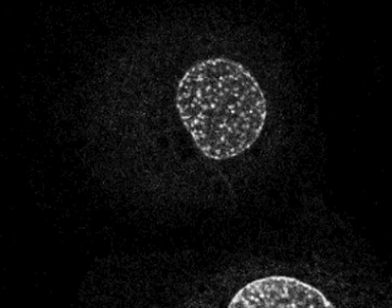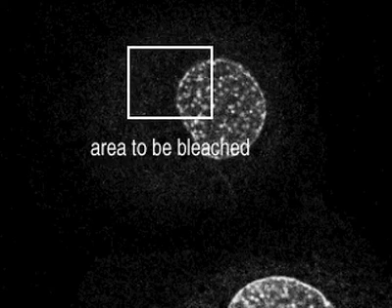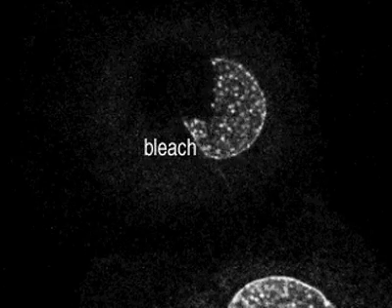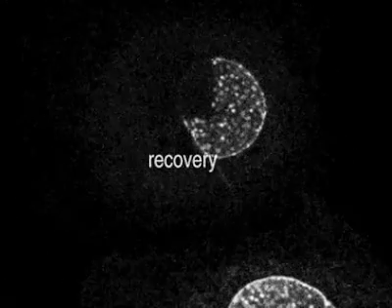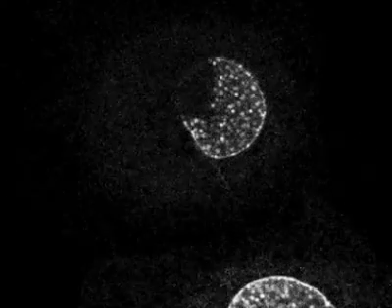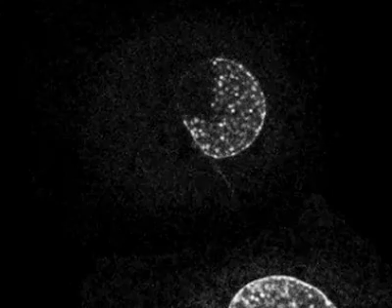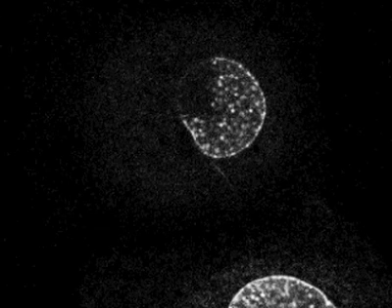The same experiment can be repeated using a protein that is firmly anchored and not free to diffuse. Here, we observe GFP fused to a protein of the inner nuclear membrane that binds tightly to the meshwork of the nuclear lamina. After photobleaching, no fluorescence recovery can be seen over the same timeframe.